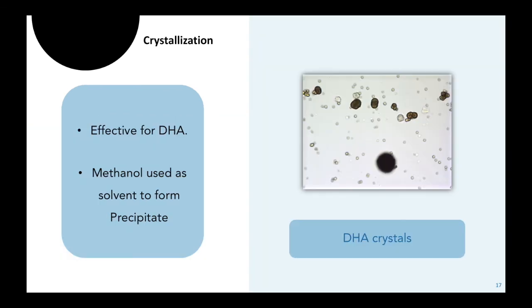Crystallization. Finally, crystallization has been shown to be a promising method of extraction, with recent studies finding it highly effective in precipitation of DHA. Solvent and crudely separated aqueous product must be heated to between 10 Celsius and 30 degrees Celsius and left to homogenize with magnetic stirring. After between 96 and 288 hours, the resulting precipitation can be drawn back through a filter to separate crystals of DHA from liquid. Crystallization results in a highly purified product.